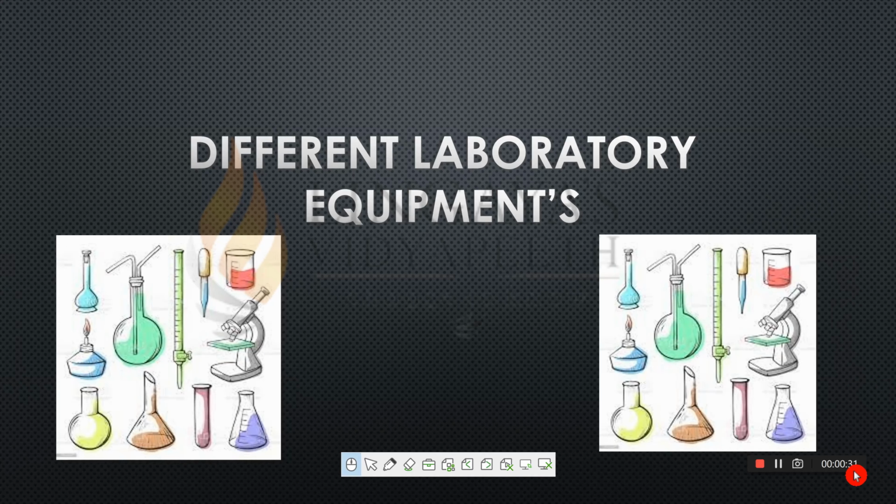And we will discuss the different uses of these laboratory equipments, that is, which equipment is used for which kind of laboratory test. So let's start the video and learn to identify different laboratory equipments.